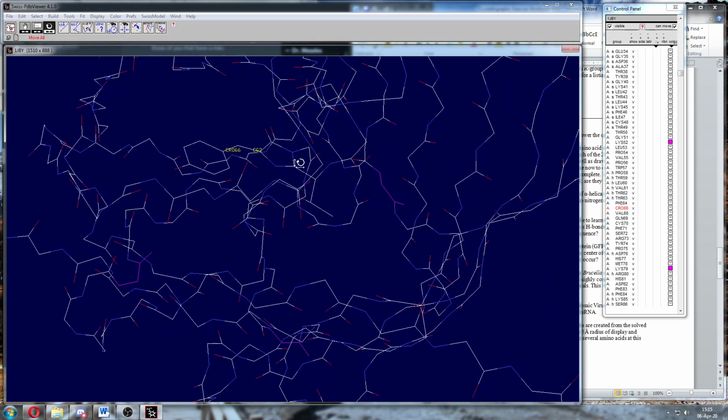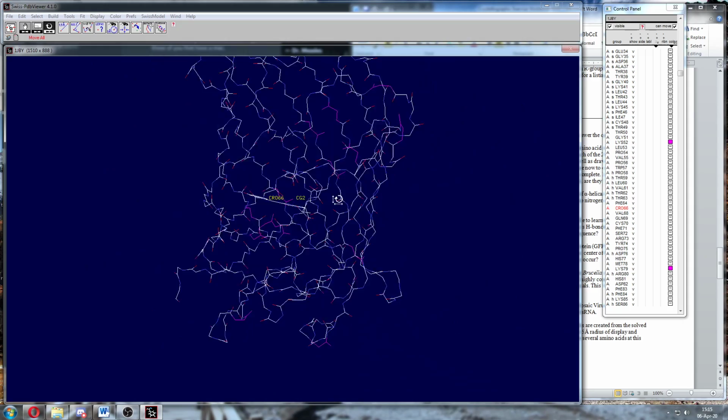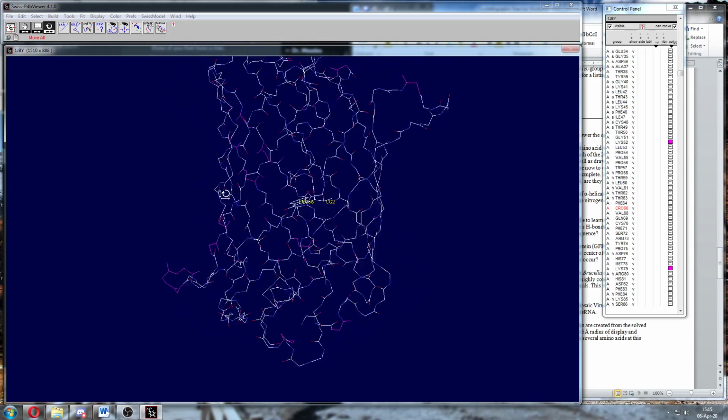So we've done some chemistry in here to make this rearranged molecule. And all we've done is extended the conjugated bond network, the double bond network, to make this a chromophore. So this is green fluorescent protein, and that's why it fluoresces green, because of that modified amino acid setup.